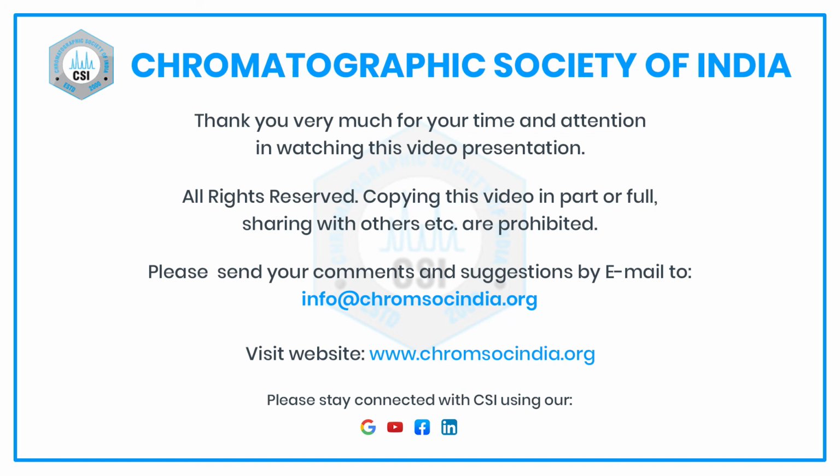But wherever you have an application, make sure you know what your application is. If it is bioanalytical, triple quadrupole is very good. If it is qualitative analysis or structural elucidation, ion trap is very good because you can do MS/MS. I have not gone into the details of that; you can look at that. There are variations of it. There are Q traps also. Quadrupole, that is all, really hybrid mass spectrometers. You have the TOF combined with the quadrupoles, all types of permutation combinations you can get today, and each has a particular application and a particular advantage. So I want you to look at that.